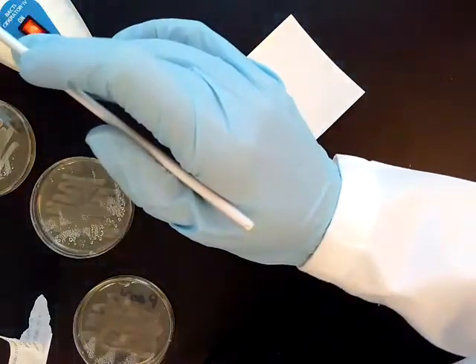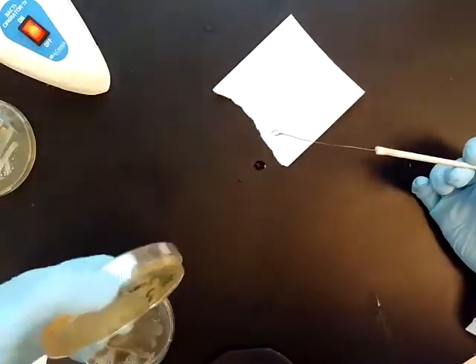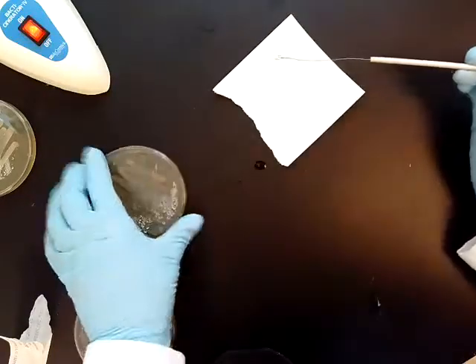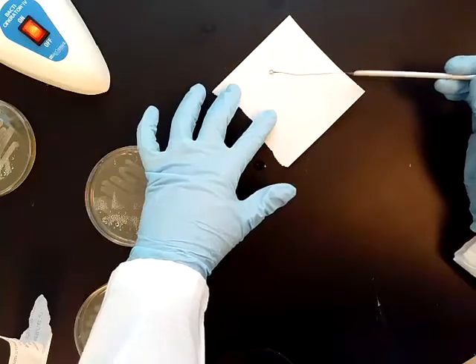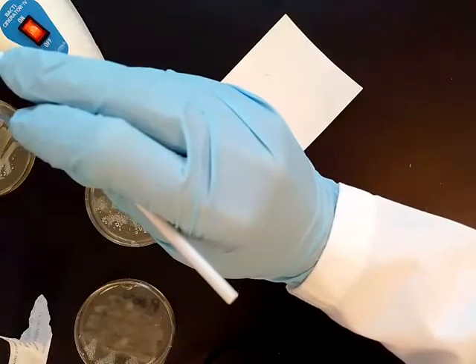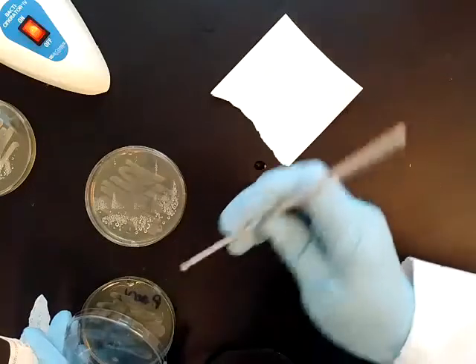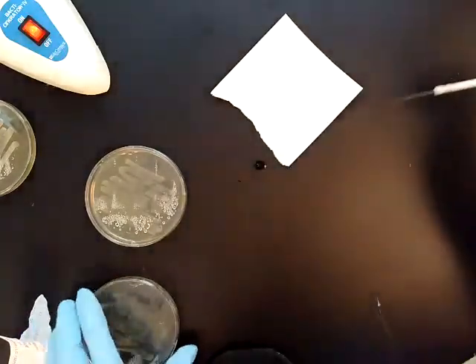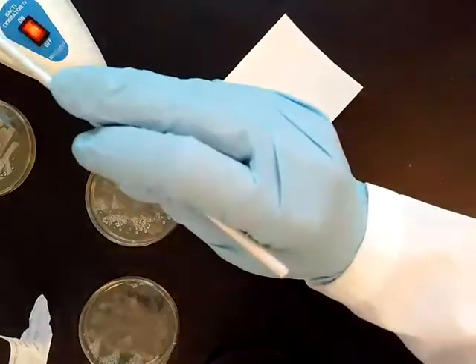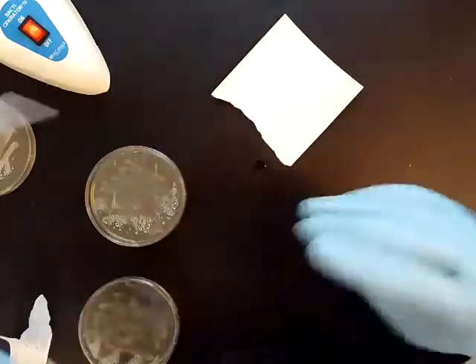So first thing we do is flame sterilize this loop, and then we're going to add bacteria directly to the filter paper. And I'm going to do a couple different samples so that you can see the difference. So once the bacteria is on the paper, you can flame sterilize and set down your loop.